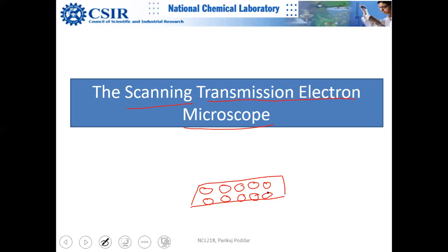So there are two things: what kind of atoms these are, and in what arrangement these atoms are placed in a three-dimensional lattice, and also what is the shape and size of this cluster of atoms, right? That third question is a very trivial question, but the first two questions are non-trivial: what these atoms are, and what is the arrangement in which they are sitting. Those are the two questions which today's scientists are interested in.